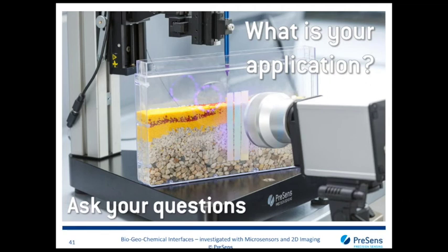We have another question that just came in. Someone has samples that contain some oil phase, or lipids inside. Regarding that, for oxygen, we can say yes. Oxygen is possible. You just need to recalculate. The measurement itself works, but you have to keep in mind that the calculation of oxygen in oily substrate or oil media is different than in aqueous media. So you have to take that into account when you do volumetric concentrations. But the partial pressures can be measured just as they are. Exactly, exactly.